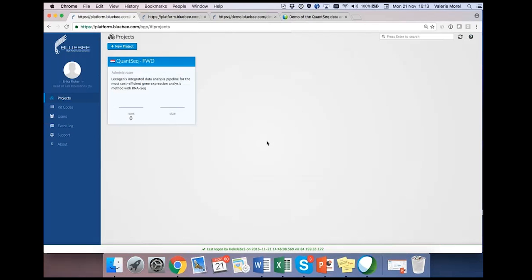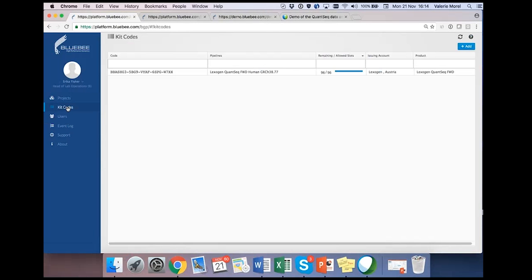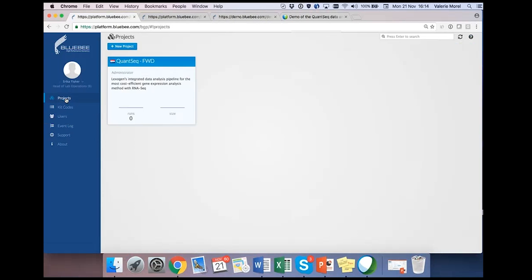So this is what you would see the first time that you log into our platform. So obviously no runs have been executed yet because it's the first time that you're accessing our platform. You will see here under the kit codes that you have purchased a kit with 96 samples, and at the moment 96 of those 96 samples are still available for you as credits, as allowed slots to process on the platform. The project is the most important part of what you will use.